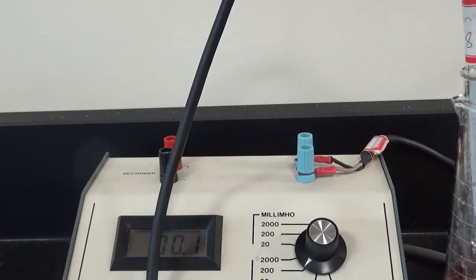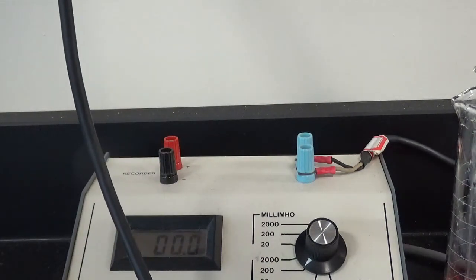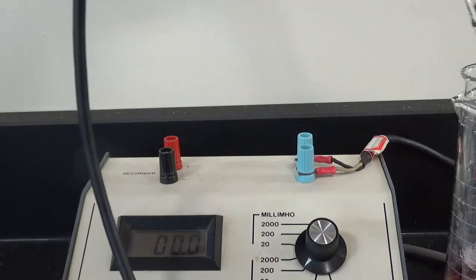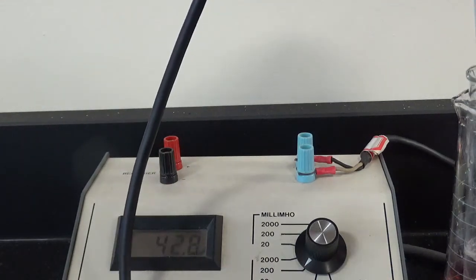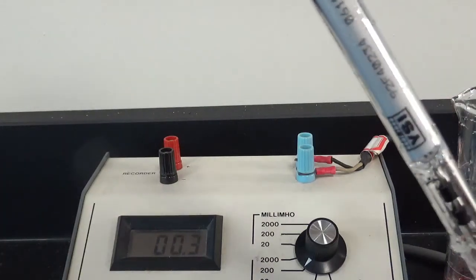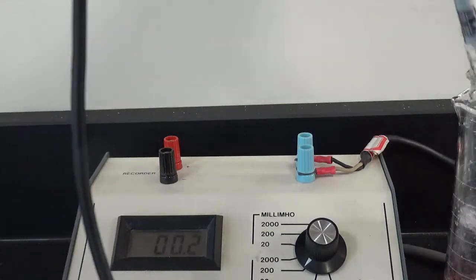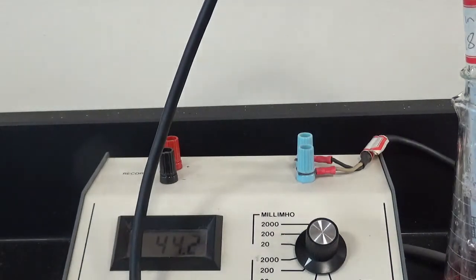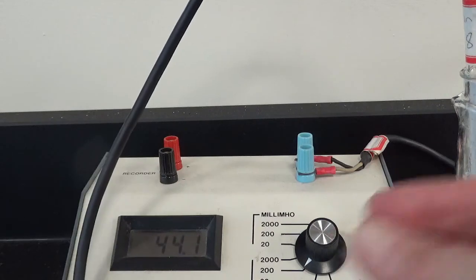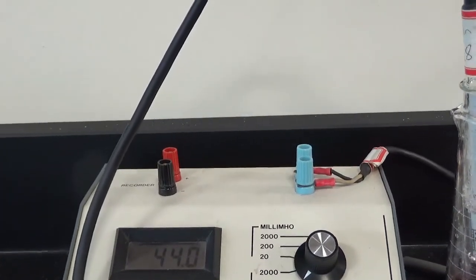Now time for the next one. Solution 3. Rinse it. Okay. And that says 44.1 for solution 3.